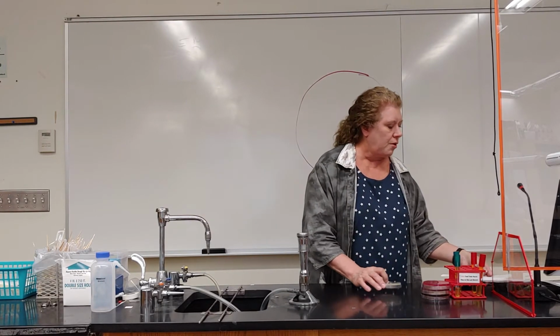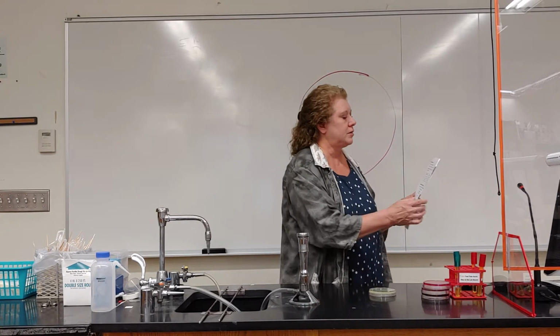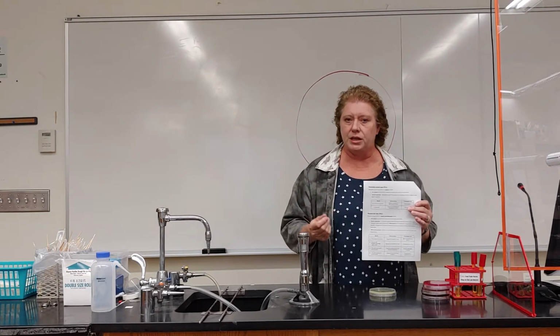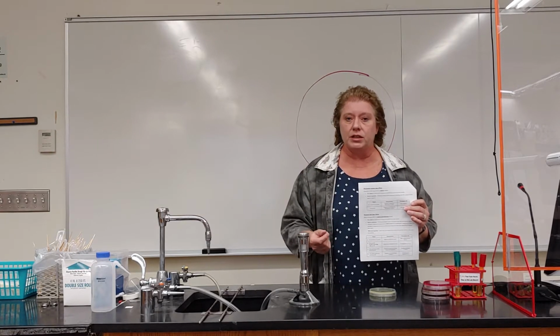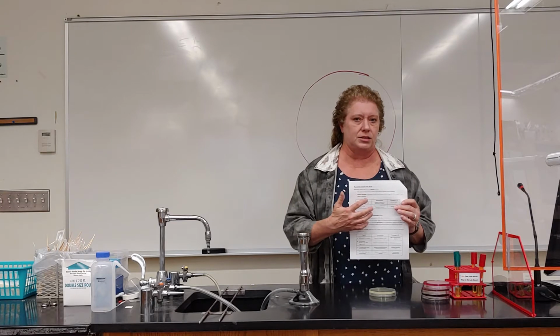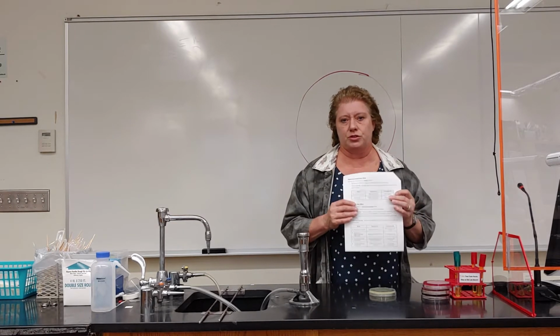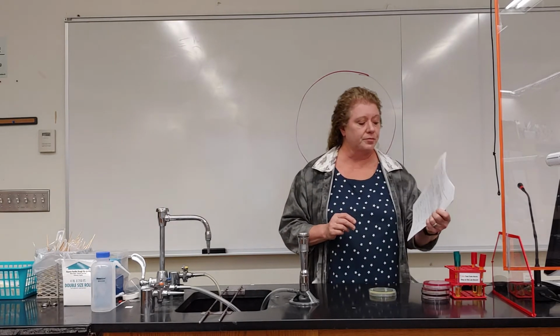So for instance, to give more details, your PEA, it tells you in your handout. This is very important information. It should be in your notebook so that you can reference it very quickly. It's going to be on quizzes and exams. It's going to be prevalent on both of those, that you'll be able to access this information, read it, and be able to answer questions quickly. So make sure you go over this, make sure you put it in your notebook, and you're familiar with it.